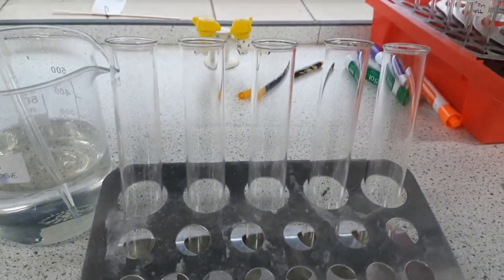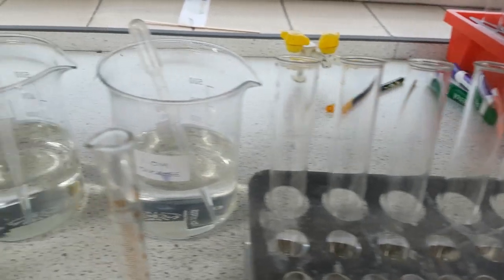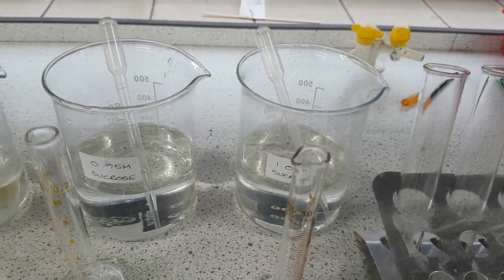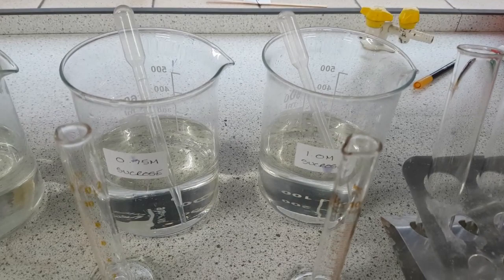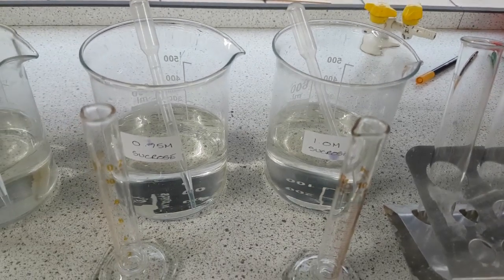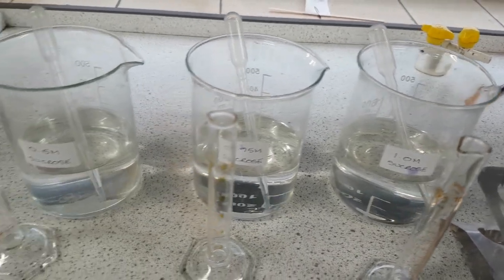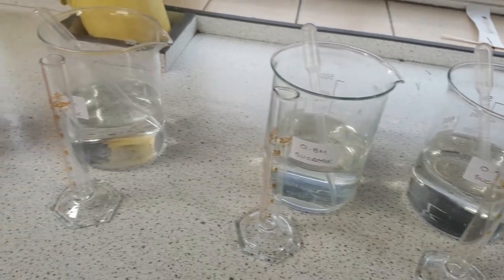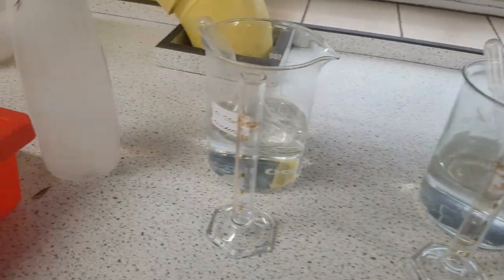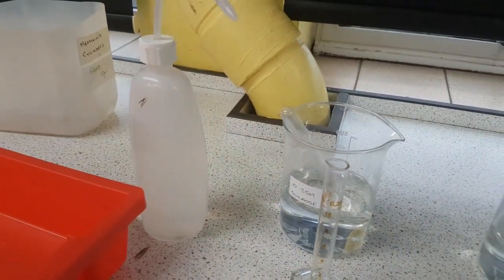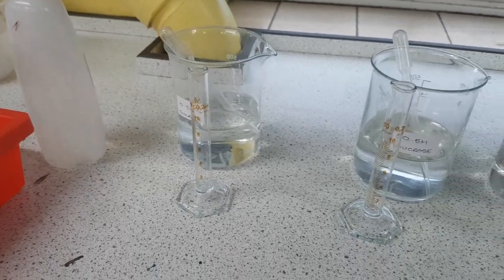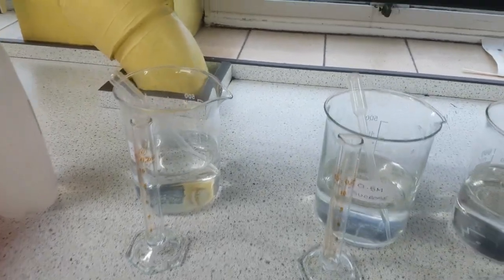We need a test tube rack with 5 boiling tubes and different concentrations of sucrose, which is basically a sugar solution. We have one molar, 0.75, 0.5, 0.25, and then finally distilled water. And we have measuring cylinders as well as pipettes.